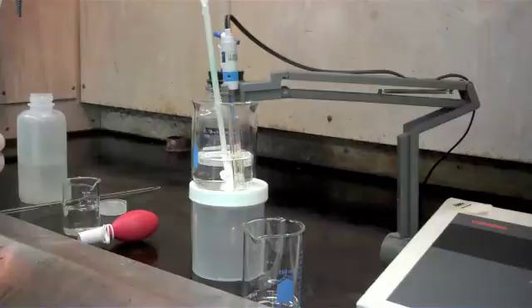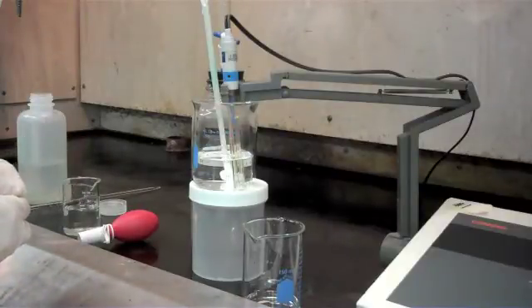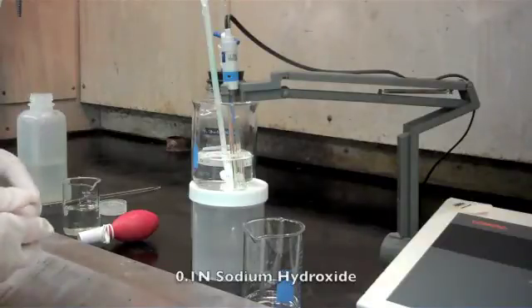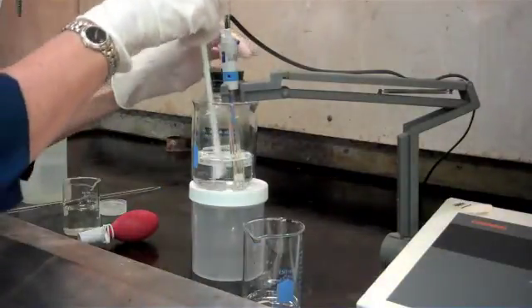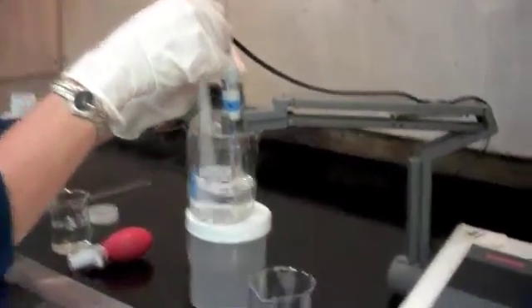Now we're ready to do our titration. The free acid — which is our first endpoint — is a titration using 0.1 normal sodium hydroxide to a pH of 4.0. I'm going to add sodium hydroxide with mixing until my pH meter gives me a reading of 4.0.